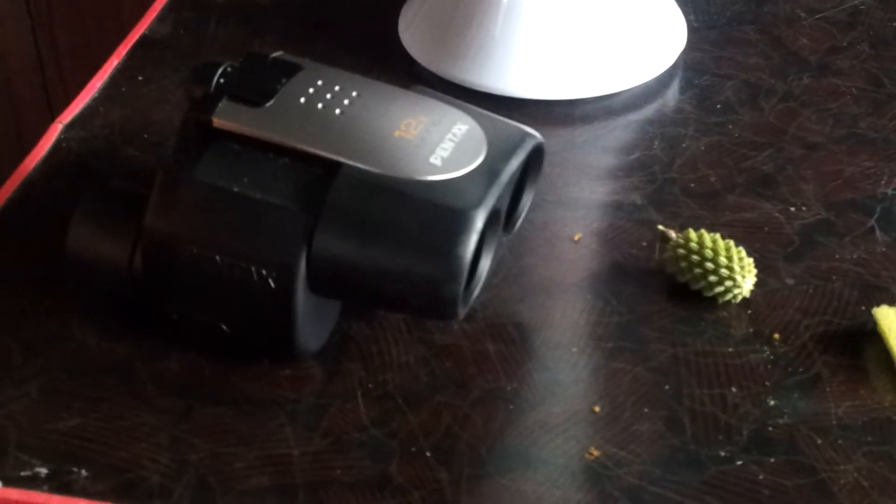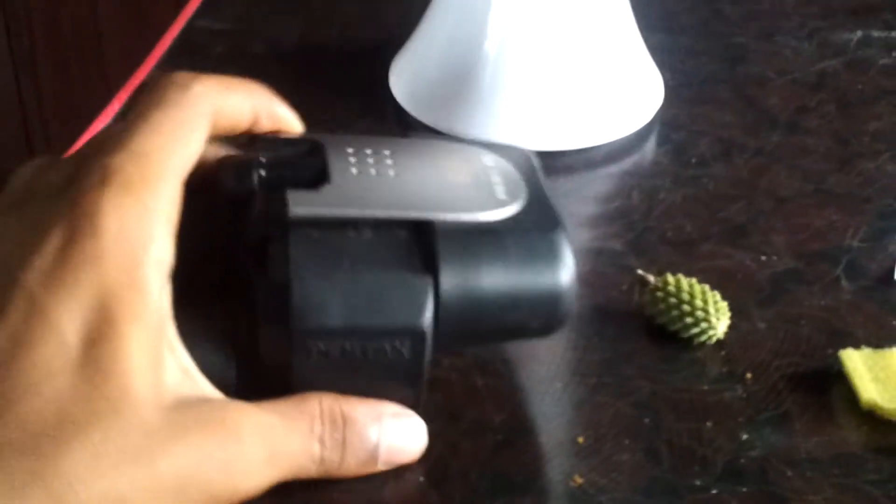This is how you do it — make a microscope with only the help of a binocular that almost everyone has in their home.